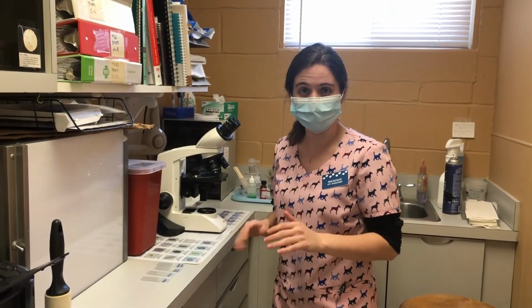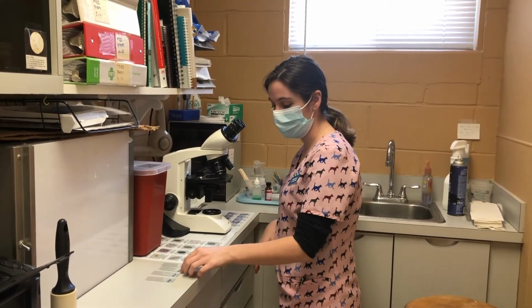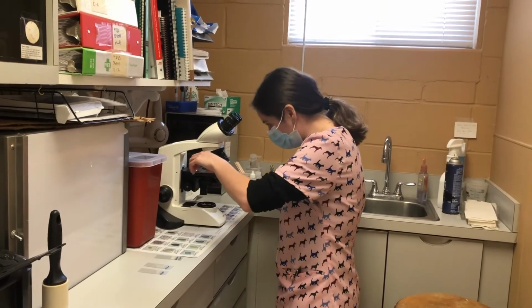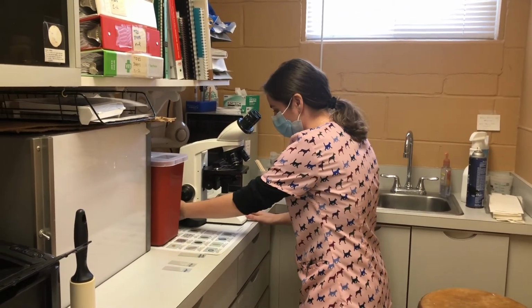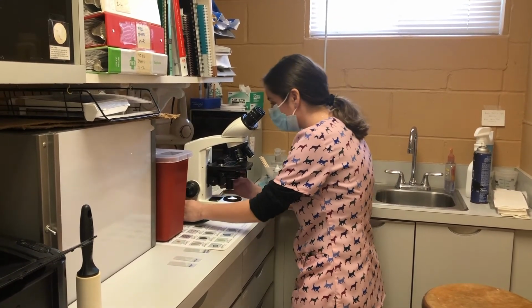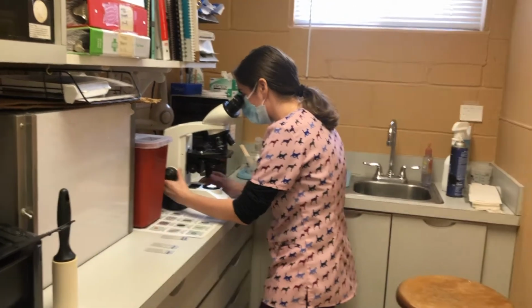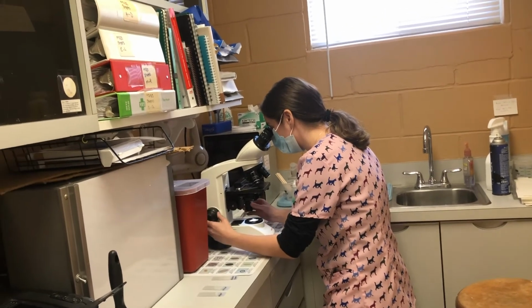So now we're going to take a look at our slides under the microscope to see if we can see any agglutination microscopically. So the first thing we're going to do is look at our controls. And our controls should not have any agglutination present if they were done properly. So we'll go ahead and take a look at it under low power. We're going to turn our condenser off so that we can see better and adjust our vision.